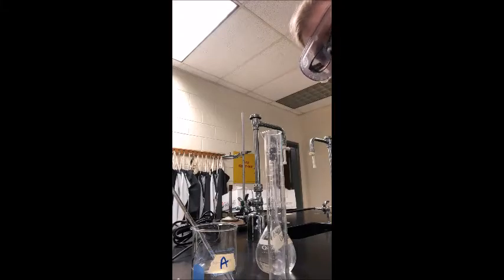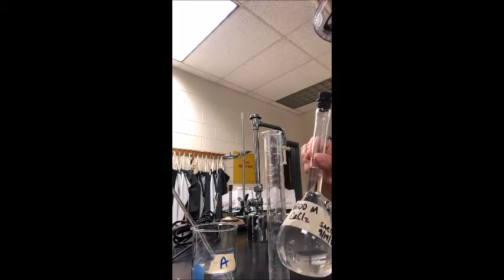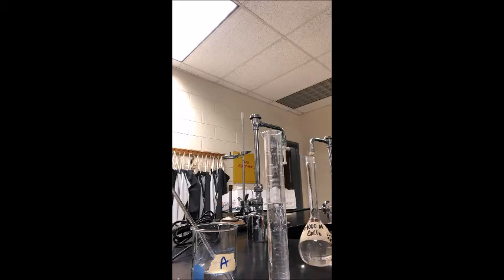Okay, so I'm getting ready to do the reaction in part 3 here, where I need to measure out 65 milliliters of my calcium chloride solution, this 0.4 calcium chloride solution. So I'm going to use my graduated cylinder here to measure, where I'm going to pour it in here. Once again, I've got to get down and see the meniscus. Right at 65. Okay, so I'm going to bend over and check it.